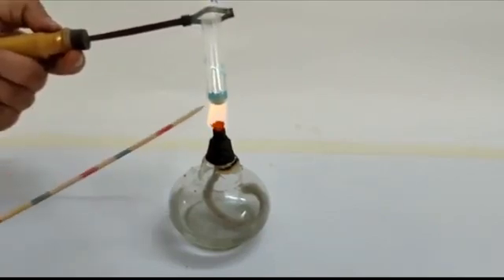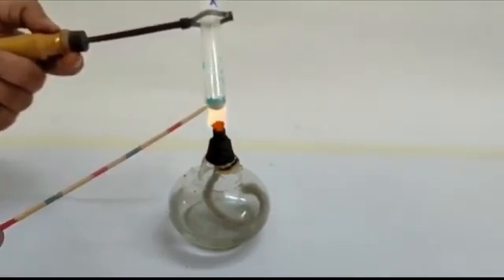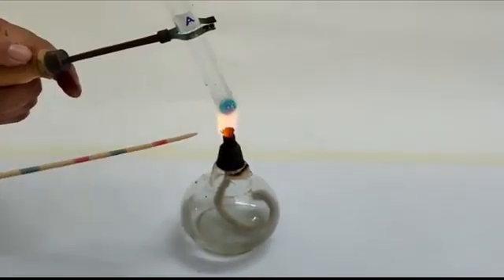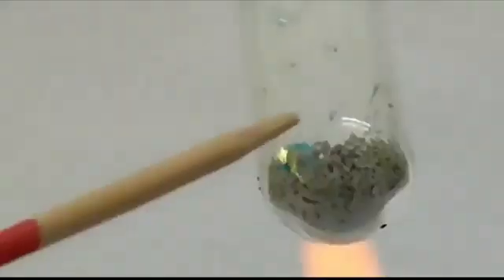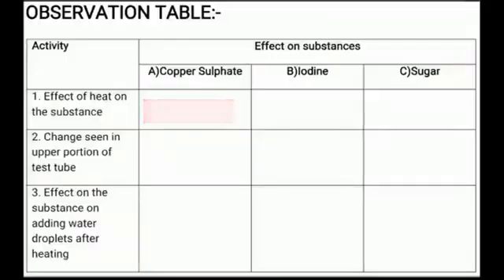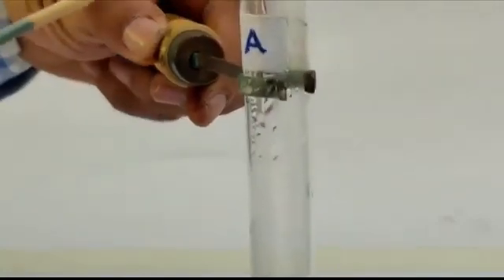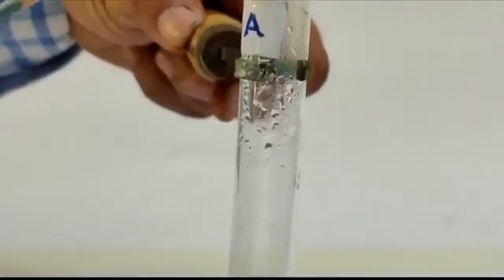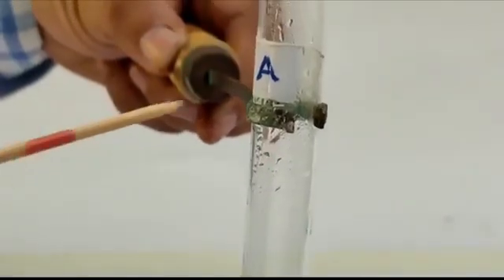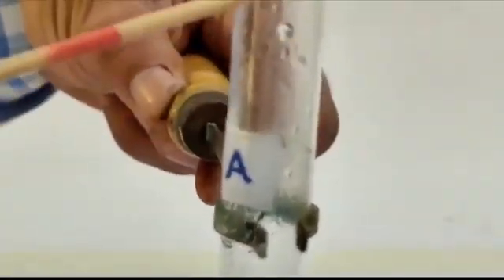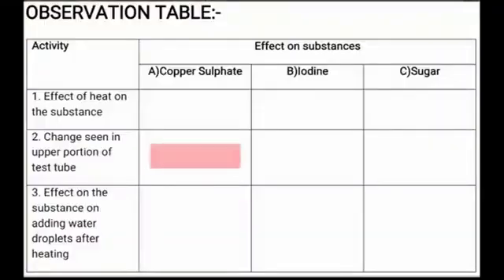Let's heat Copper Sulphate in Test Tube A. Observe the effect of heat and note down your observation. Write your observation in the given table. Now, observe the upper part of the test tube and note your observation in the table.